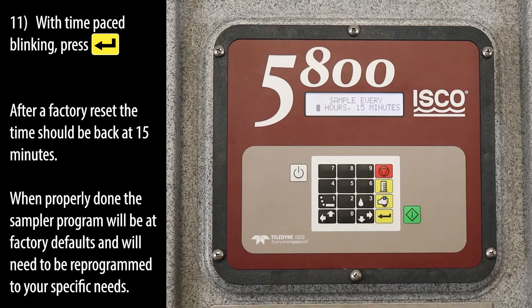After a factory reset, the time should be back at 15 minutes. When properly done, the sampler program will be at factory defaults and will need to be reprogrammed to your specific needs.